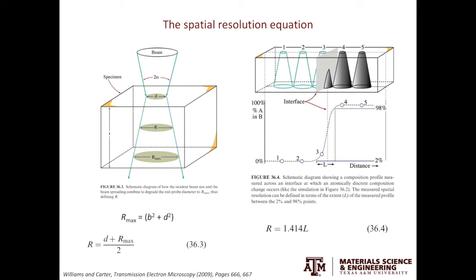Due to the cone shape of the interaction volume, it will introduce artifacts when we do chemical analysis across an interface. Assume we have an interface that lies parallel to the electron beam direction, then we have the electron beam scanning from left to right. In theory, there should be a sharp transition of the chemical composition across the interface. However, due to the beam spreading, the measured compositional profile is sigmoidal in shape.